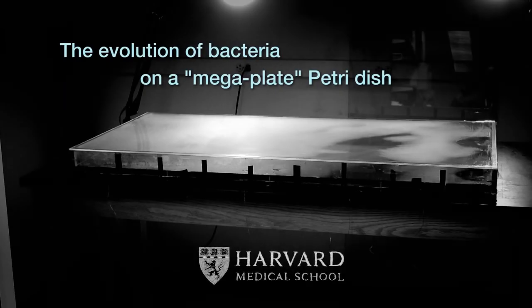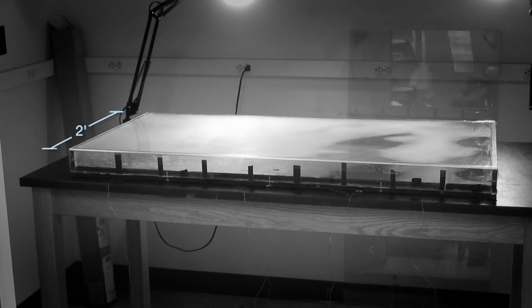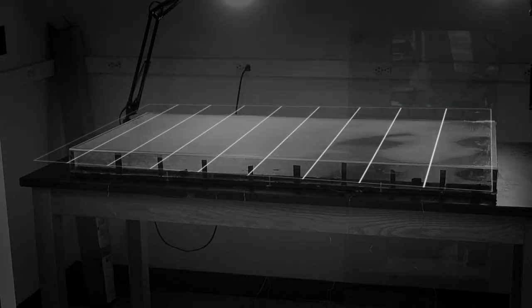So what we ended up building was basically a Petri dish, except that it's 2 feet by 4 feet. And the way we set it up is that there are 9 bands, and at the base of each of these bands, we put a normal Petri dish thick agar with different amounts of antibiotic. On the outside, there's no antibiotic. Just in from that, there's barely more than the E.